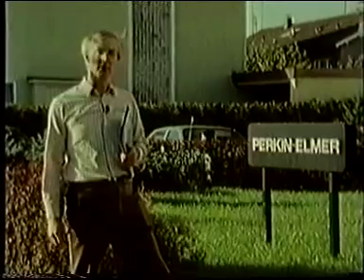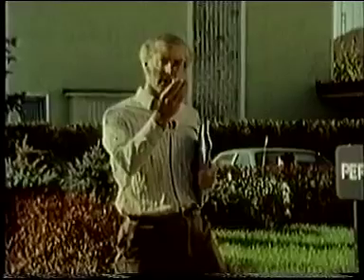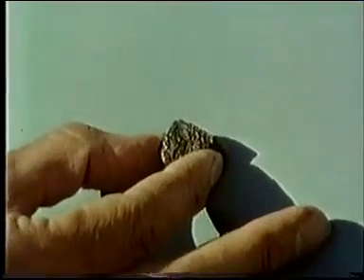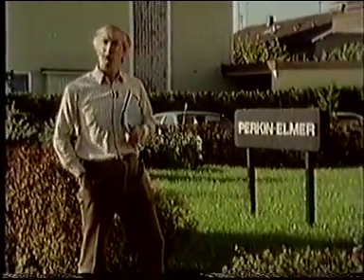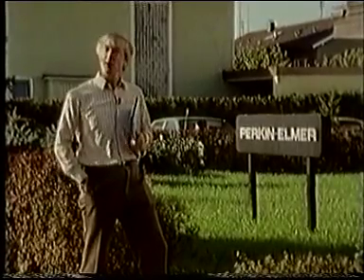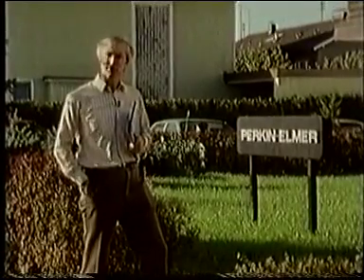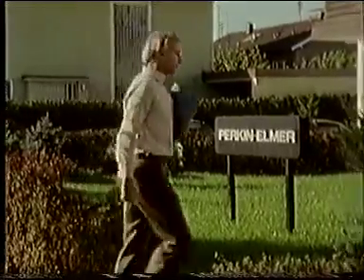Munich to learn about. Now, we tend to speak of the catalyst as metallic iron, but it also contains promoters, potassium, calcium and aluminium, all in oxygenated form. But it isn't in the bulk, but at the surface, the reaction site, that the promoters influence reaction rates. So what are their surface concentrations? Well, in here, they can answer that question. So let's go in.